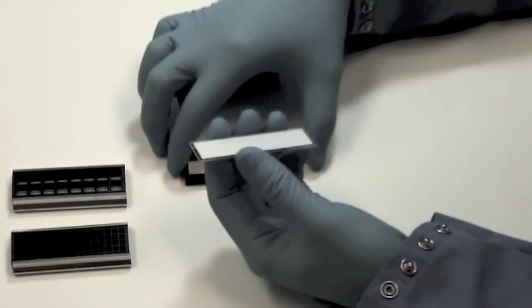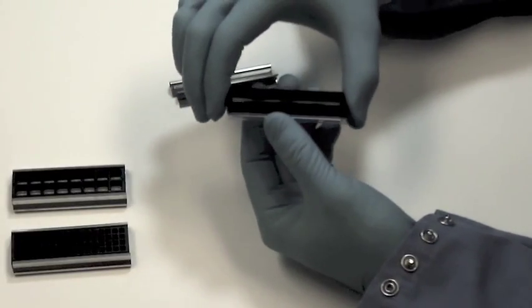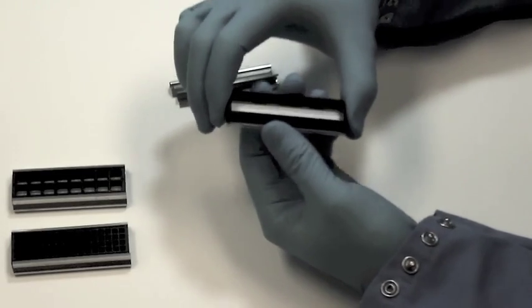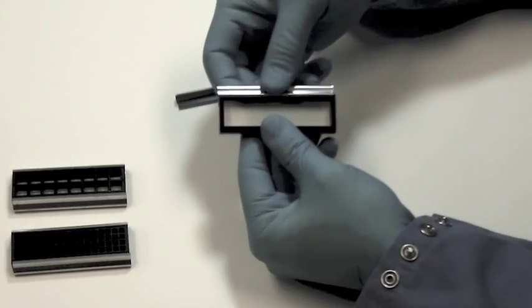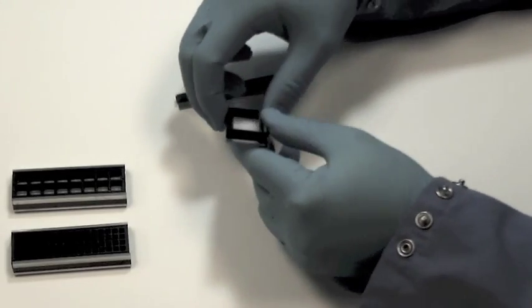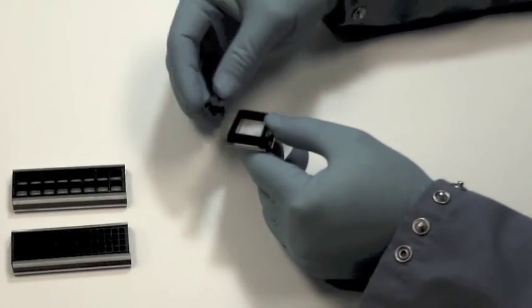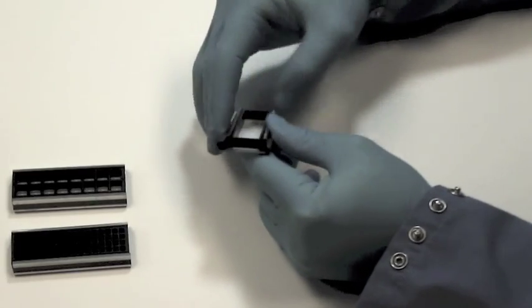There is also a system that forms a single chamber over the slide. Use of the ProPlate system can minimize the volume of reagents required during hybridization and processing. As little as one milliliter can be used to hybridize a single slide.